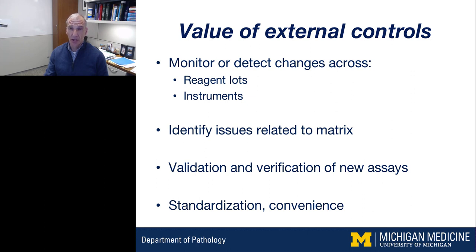And even for laboratory developed tests, first and foremost, having a commercial source for assay controls, low positive and high positive controls, that's really important. That's been an approach that we've taken with our LDTs in the past as well. So there are a variety of scenarios where external controls can add value, and we're looking at processes to start to incorporate those more into our quantitative tests.